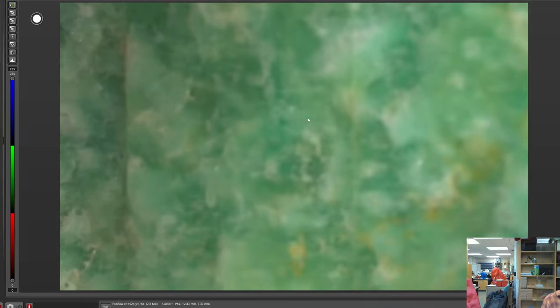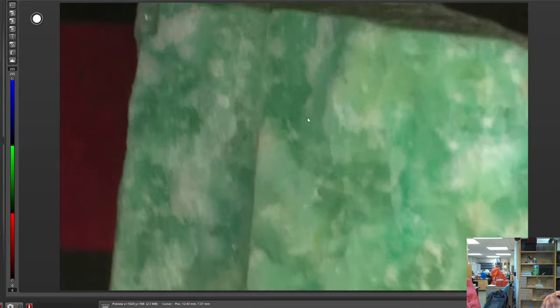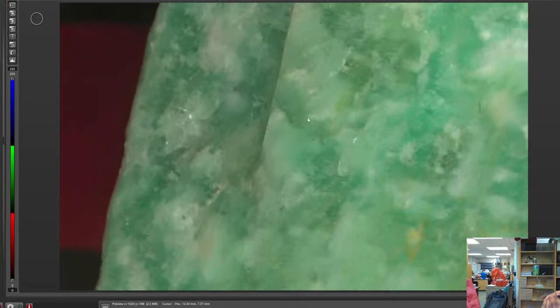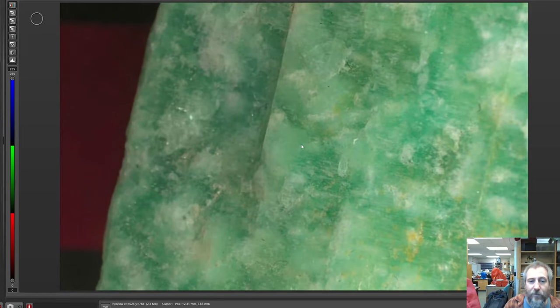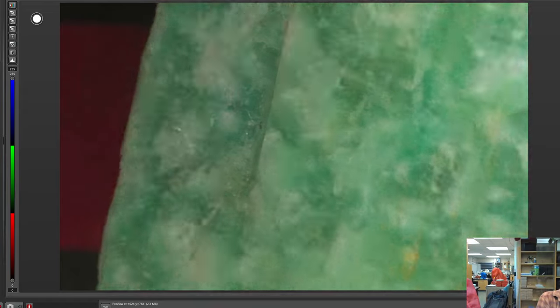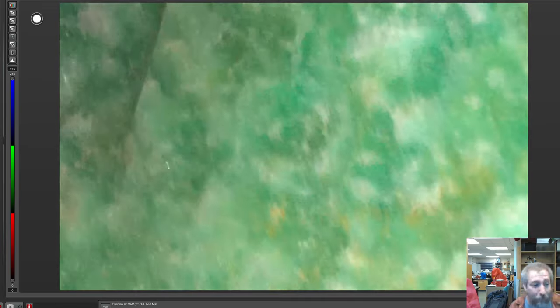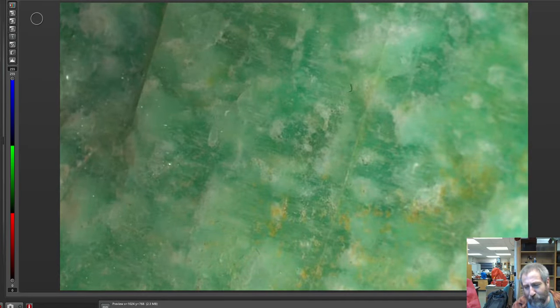I'm not sure what this green mineral actually is. It's got really strong cleavage. Maybe Volcano Doc knows the answer. My mineralogy is probably as rusty as her paleontology is. Yeah, it's got some conchoidal fracturing. This one's got cleavage planes. Can I scratch it with my quartz? That's a good question. It appears to be scratching the quartz. I'm going to say no based on that. I cannot seem to scratch it.